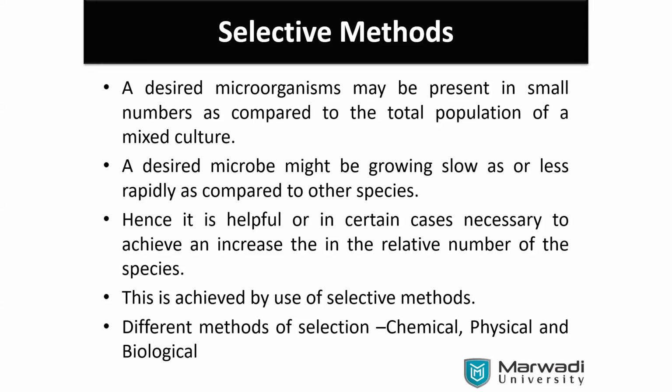Yeah, this one is fungi. Oh, this was the fungi. This one is the bacteria. Fungi will be filamentous, highly. You will observe in a way that.